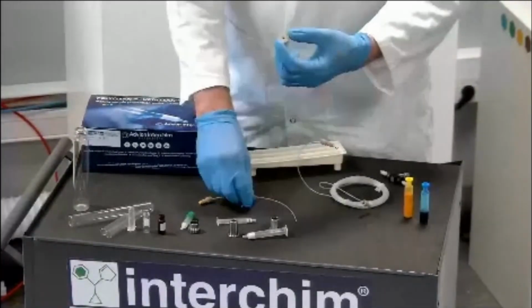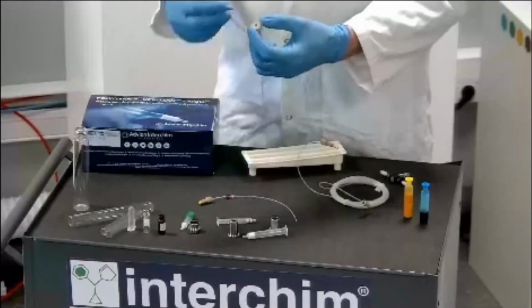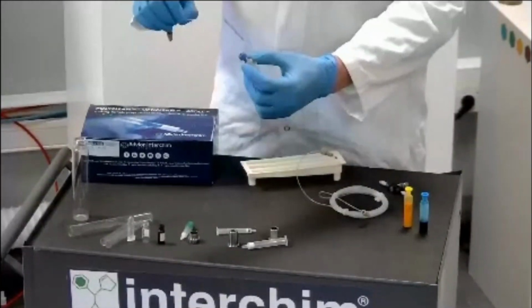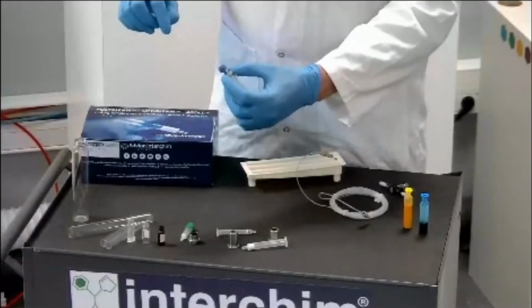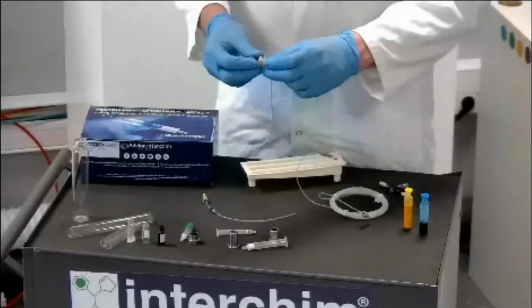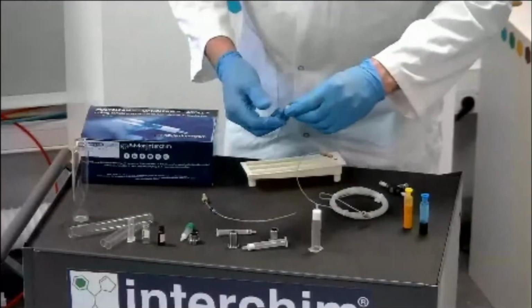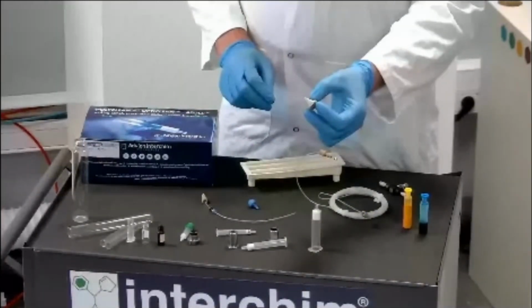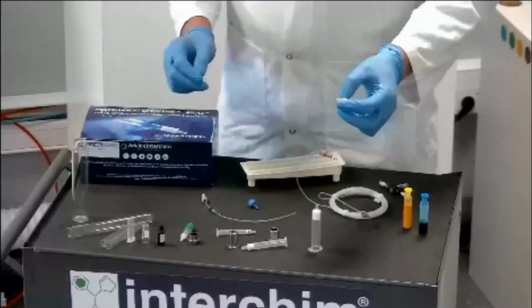And for it, we just have to use this type of fitting, you screw, and you put your tubings inside the adapters to load sample and solvent through the sorbent. That's why with this one, you can use various column sizes for your purification.